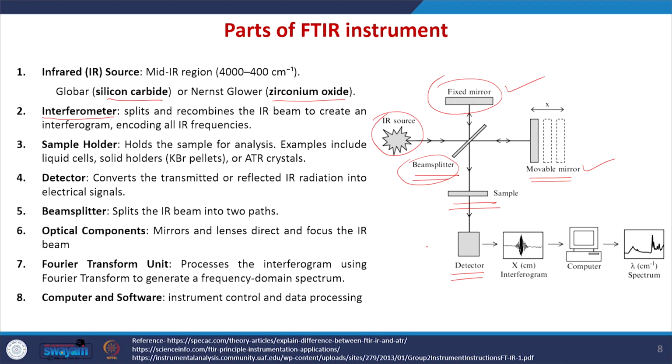So, here the sample holder holds the sample for analysis. The sample holder can be liquid cells, or solid holders if you are using KBr pellets, and we can also use the ATR crystals if you are using the ATR FTIR. And we have the detector.